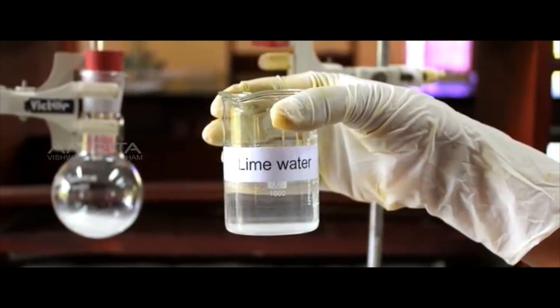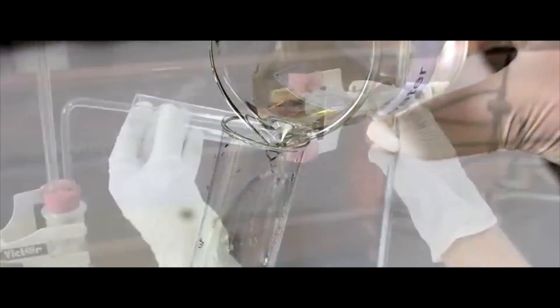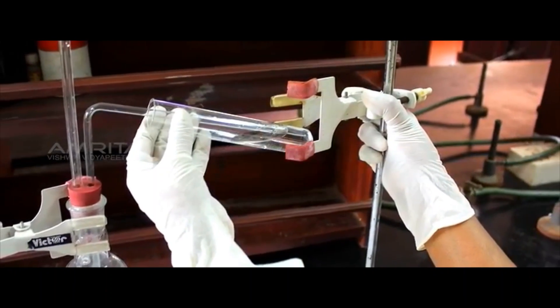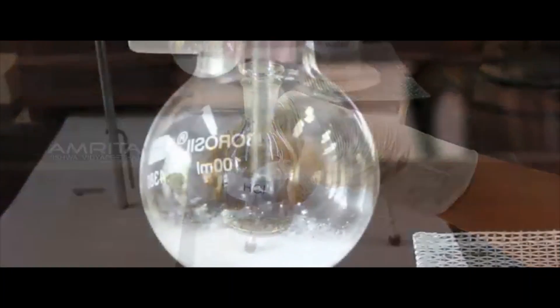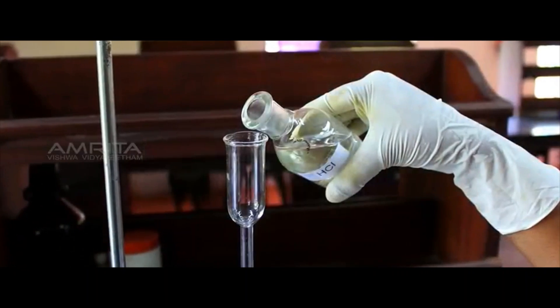Now pour a small quantity of lime water into the boiling tube and clamp it with another stand. Then add HCl to the sodium carbonate solution in the flask using the thistle funnel.